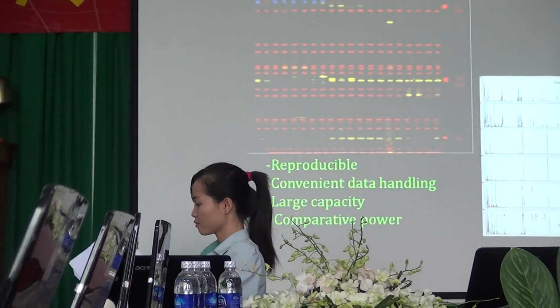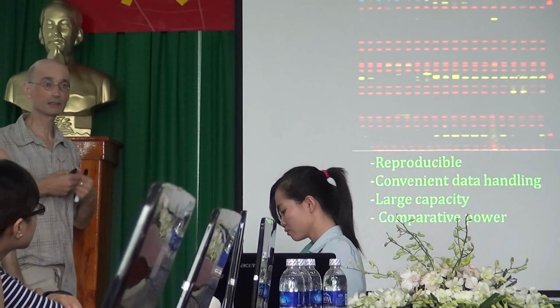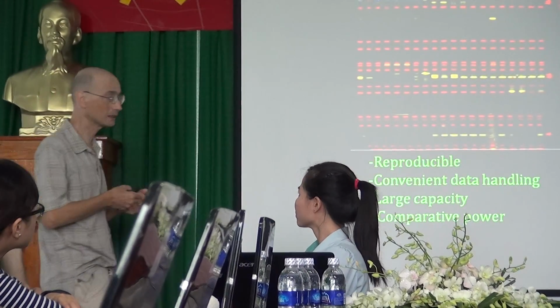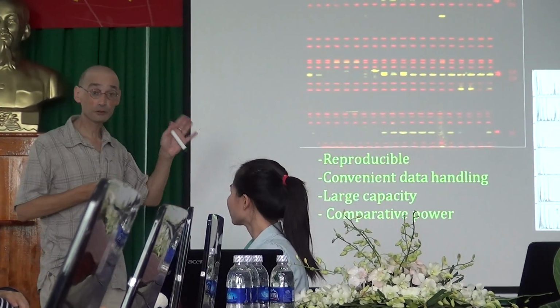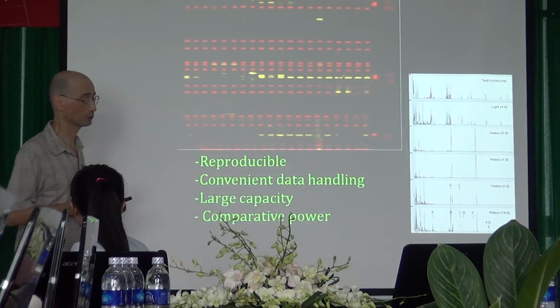What is the advantage of TRFLP? It's reproducible. It's a technique that you do again and again and again, and in comparison to other fingerprinting techniques, this one is very nicely reproducible.